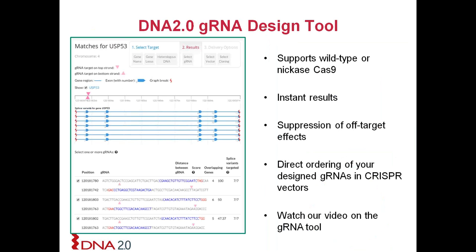Now I'll just show you how you can also minimize off-target activities by just selecting the right target. We have developed a tool to help you select a target to hit any site of interest. It also accounts for any other sites that are present in the genome that may be similar to it. It may be 1, 2, 3 bases off, but we give a negative score to those target sites, and these get rank ordered based on ones that are most unique in the genome and least likely to have off-target activity. Let me go to the tool and demo it for you really quickly.